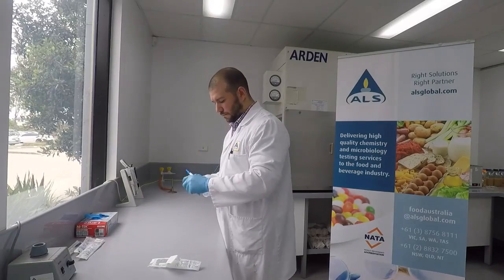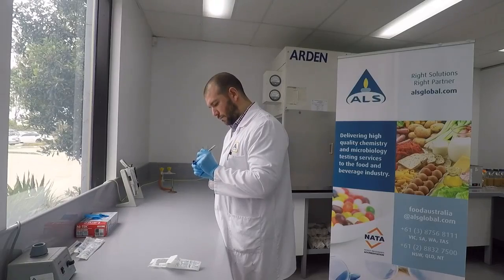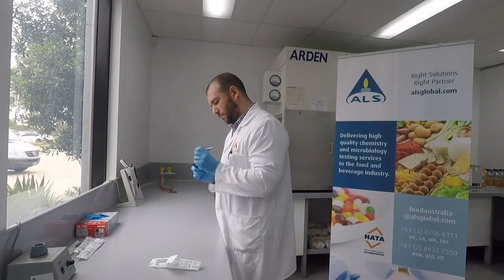Using a permanent marker, label the tube with the date, time and a unique identifier for the surface sample. Keep note of this separately for the sample submission form.